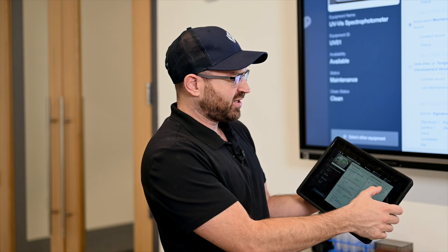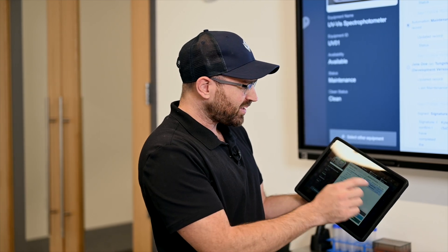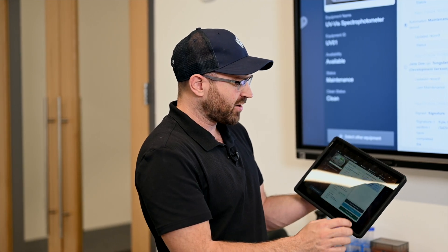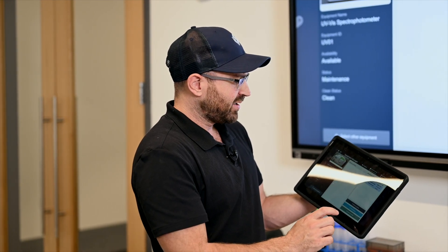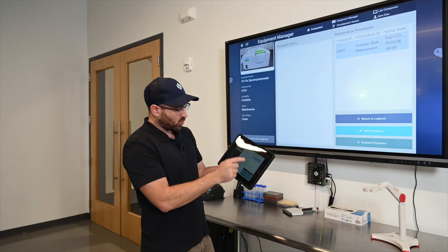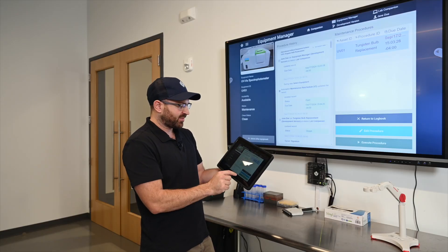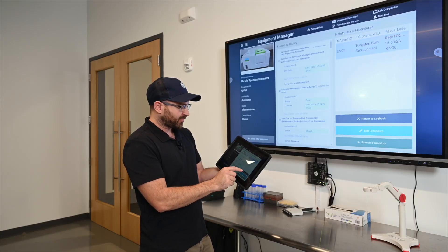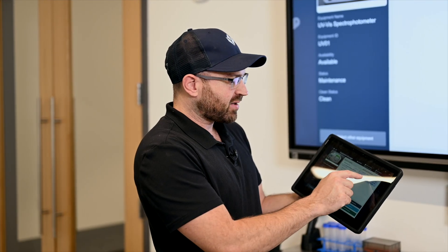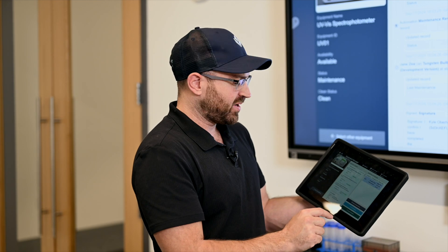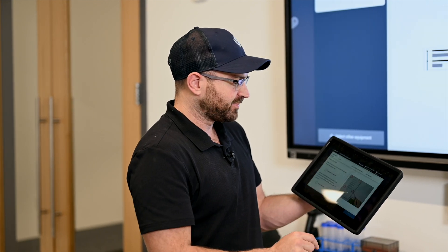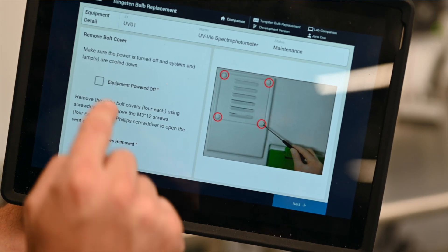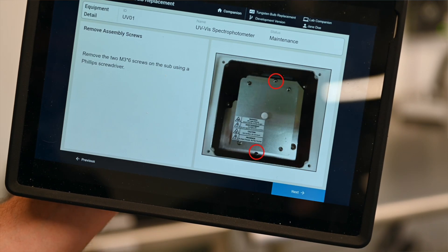So I look at this maintenance procedure for the bulb replacement. This is the one that requires work. I can look at its history. I can see when it was last performed, who performed this exact procedure. I can also jump directly into this procedure from here and execute it. So by executing this procedure it'll give me instructions on how to perform this maintenance activity.